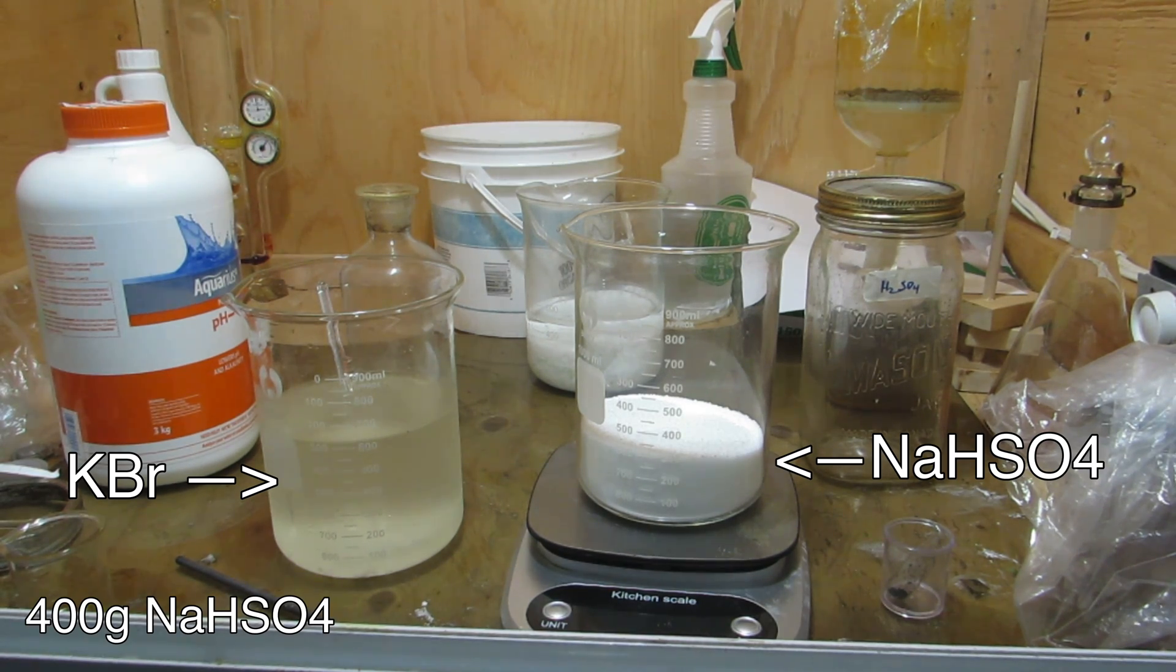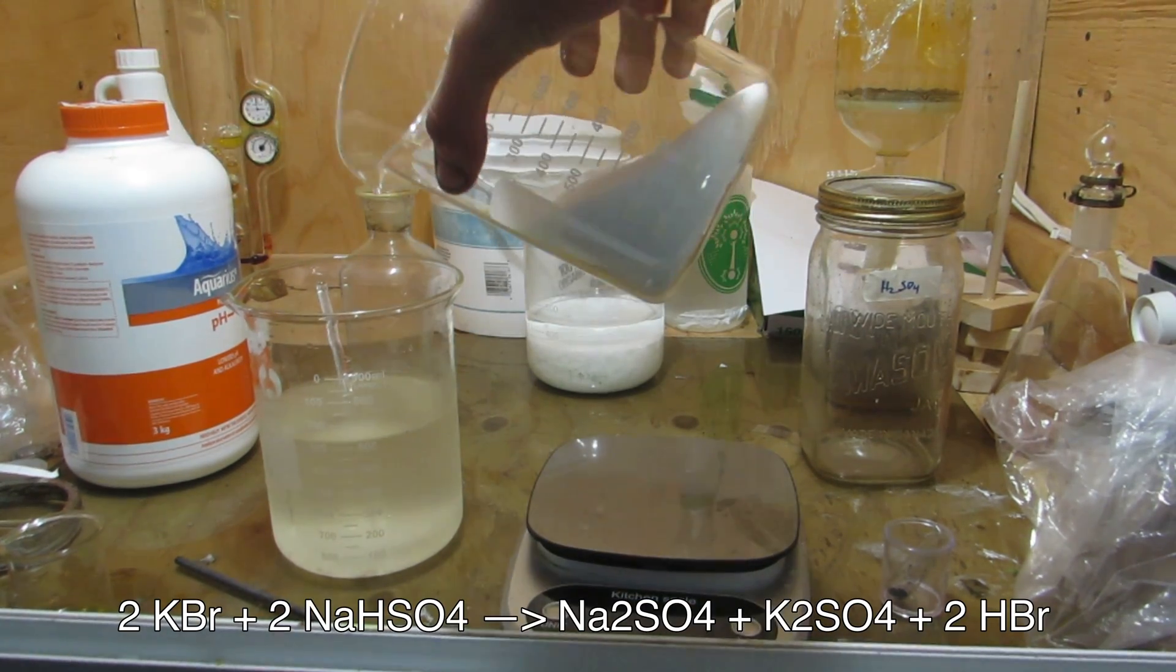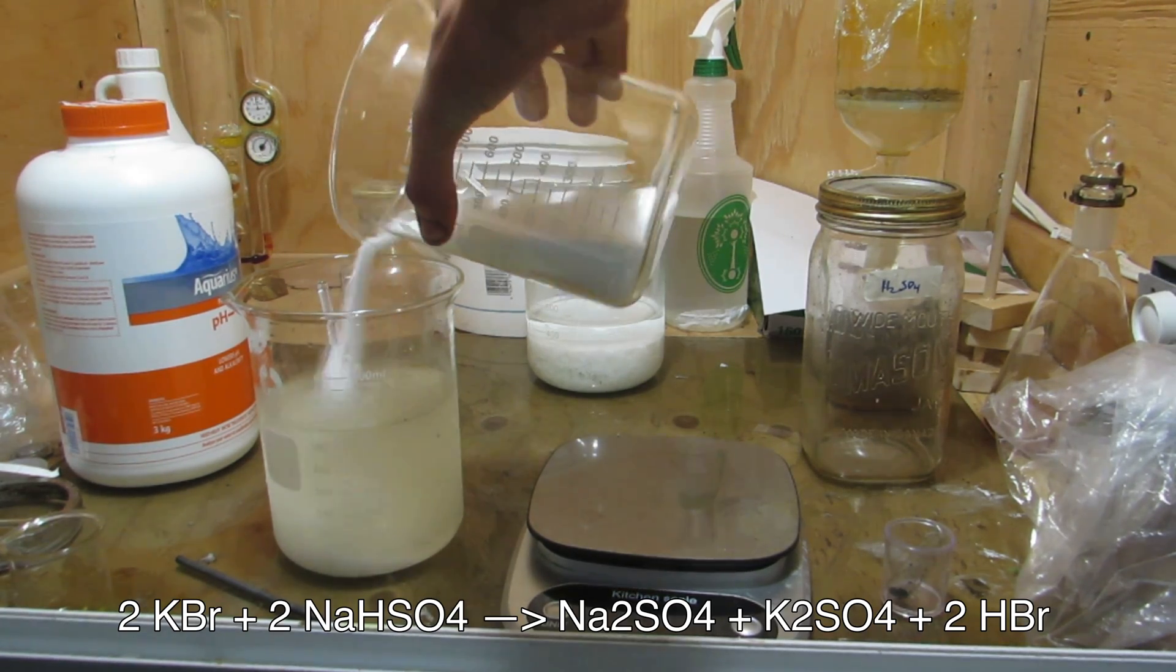Next, 400 grams of sodium bisulfate was measured out and added to the potassium bromide solution. Sodium bisulfate could be purchased as a pool chemical.